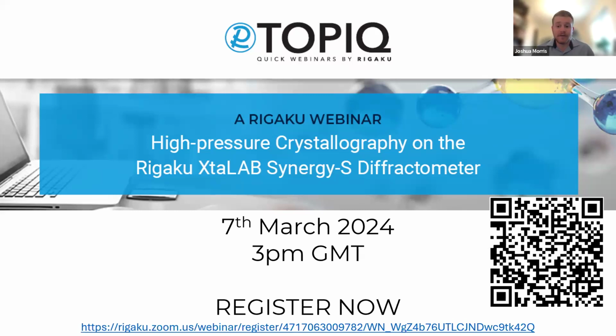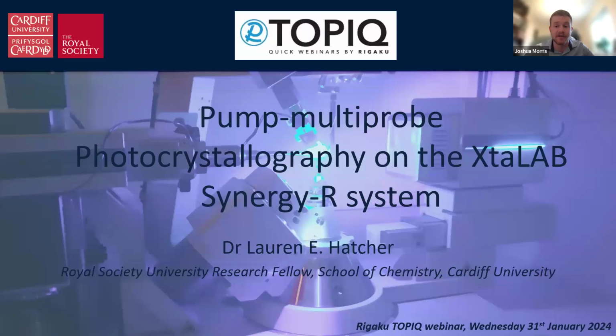So Lauren's research is focused primarily on the investigation of structure-function relationships in switchable materials and looking to understand the key structural influences that impact their functionality. Lauren's group primarily uses in-situ crystallographic techniques, in particular photocrystallographic techniques, to study these switchable materials in real time, and from that generate molecular movies to follow and track these 3D crystal structures over time and look at the photo-induced changes. As I'm sure a lot of you know, these kinds of pump-probe experiments were previously quite limited to synchrotron sources, but with the new advancements in X-ray generation, the increased flux available and the increase in detector science, it's now possible to conduct these microsecond-scale time-resolved experiments in the home lab. So I'll now hand over to Lauren for what I'm sure is going to be a very interesting talk.